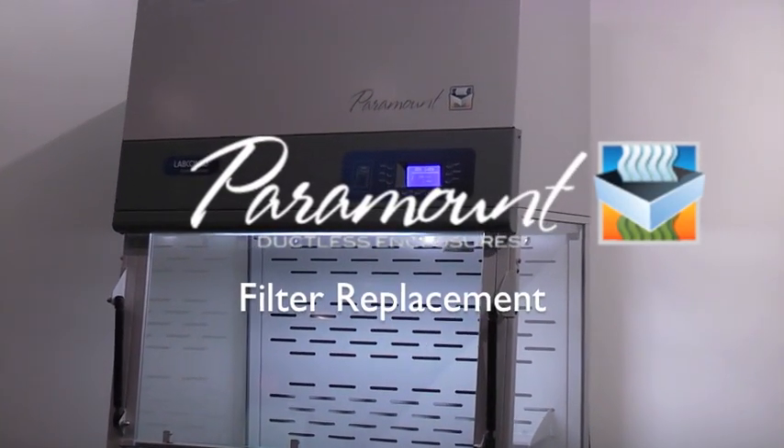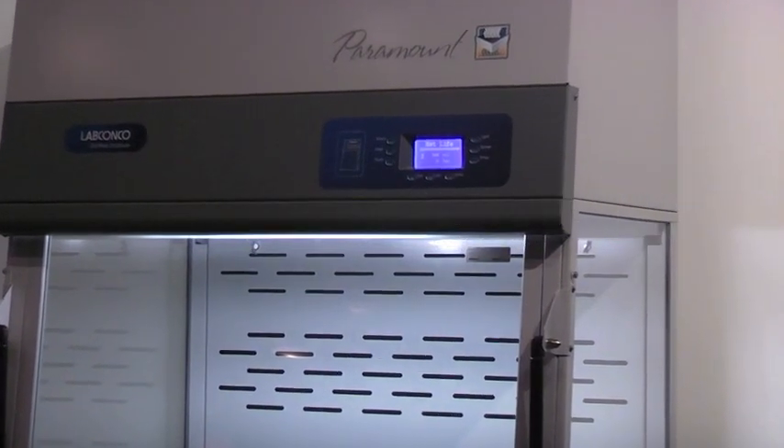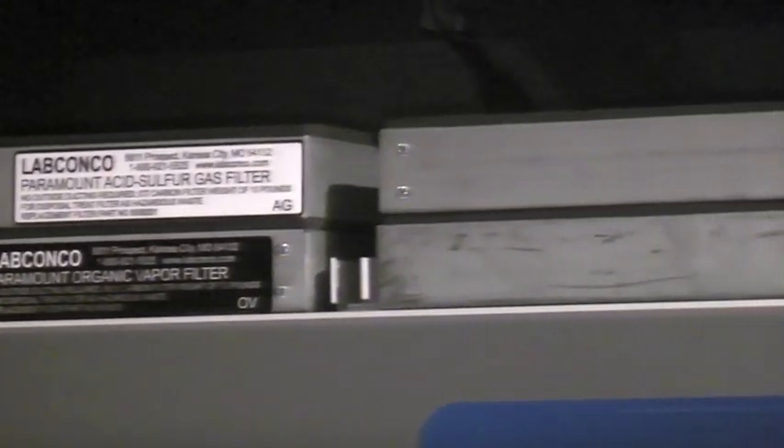LabConco's Paramount Ductless Enclosure can be used with seven different stackable filter types. Two filter types can be utilized simultaneously for multiple applications.